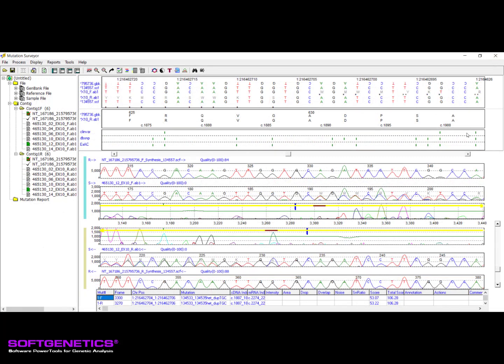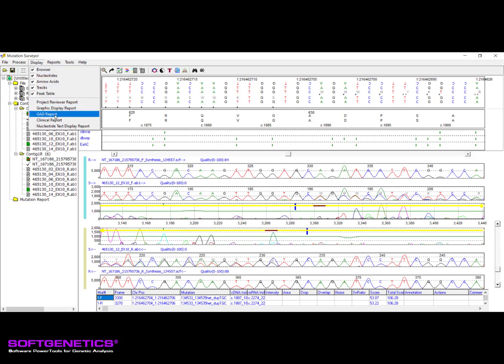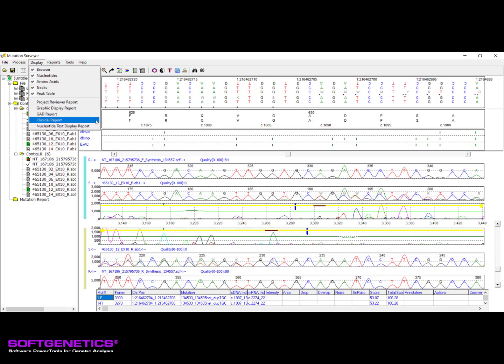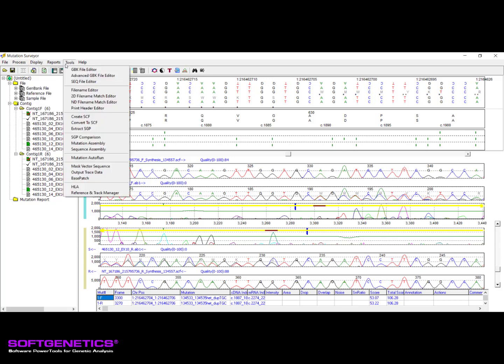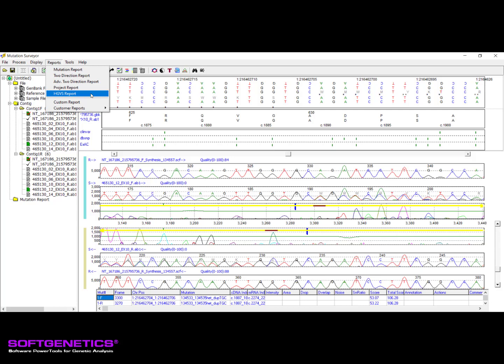Once the reviewing is complete, Mutation Surveyor offers several different reporting options. Graphical reporting options, which include electropherogram display, can be found under the Display menu option and output to formats such as JPEG and PDF. Reports that are in table format are located under the Reports menu and can be output as text, Excel, XML, HTML, or VCF files. One such report, the custom report, is featured in a separate webinar that we highly recommend viewing.